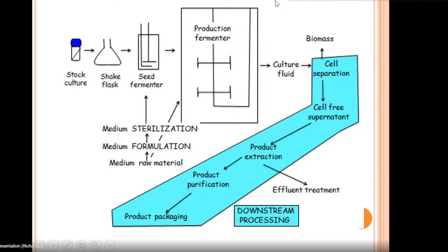Now after that, the production is going to take place. Then the culture fluid will be removed. Culture fluid is here the production media which I spoke about in the first point, which is the food item for the microorganism. So culture fluid needs to be removed. Then from this culture fluid we have to separate out the cells of the microorganisms. The microorganisms need to be extracted out, and then the downstreaming process will start, where we separate our product from the byproduct.